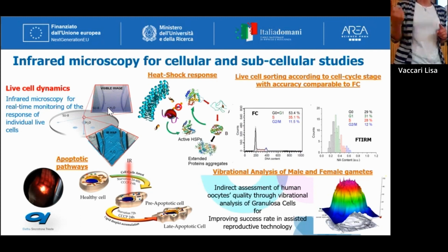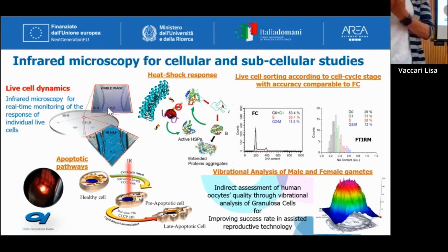Okay, our goal now with our ICGB colleagues is to try to understand among different inactivation methods, okay, which is the one with the least impact on the vibrational profile of the cell. So we tried UV, we tried thermal treatment, we tried, okay, classical paraformaldehyde. At the moment we did these experiments just 1 week ago. The first thing that I told them, forget the thermal treatment. Thermal treatment is always too harsh.